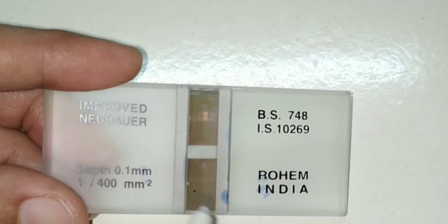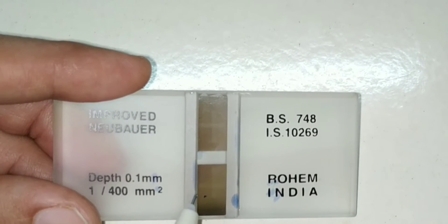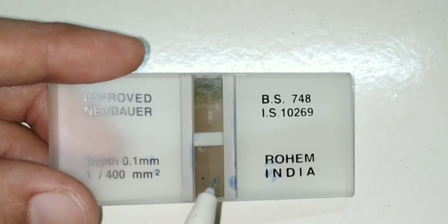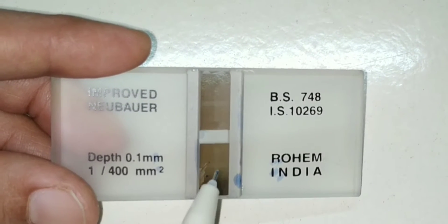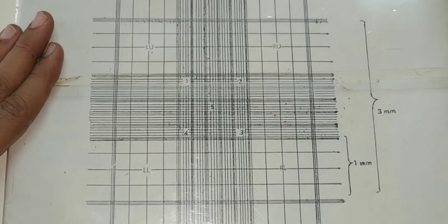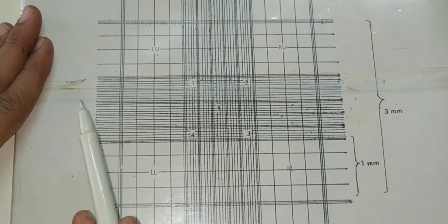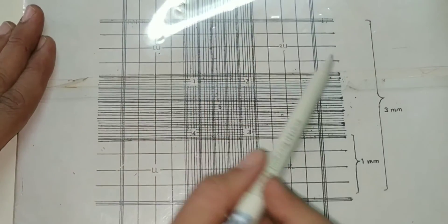The counting area, known as the counting grid, consists of squares of different sizes. You can see various squares of different sizes visible in this central counting area. Under low power, this counting grid measures 9 mm², that is 3 mm by 3 mm.